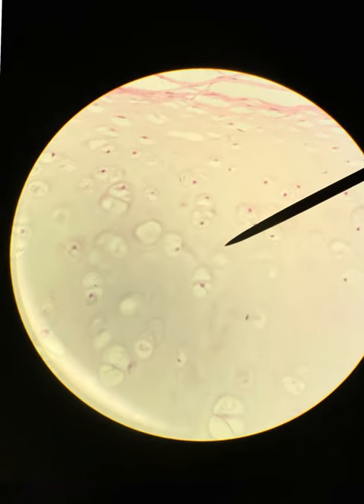This is also a cartilage. It's called hyaline cartilage, and it is used to cushion, support, and reinforce other tissues and organs. And it's actually the most common cartilage found throughout the body. It's also the weakest cartilage in the body. And I really like this because you can easily see the chondrocytes, and they actually excrete this matrix that they're in, and then they get stuck in the matrix. So this is just a really cool picture. It also has like this glassy appearance. And this is found in the embryonic skeleton, actually.